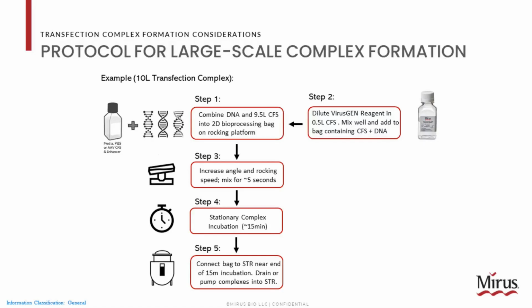So now let's bring it all together and show a real workflow for a VirusGen process at the 100-liter scale. This is from an actual customer process. Here we see that the customer would filter the DNA and complex formation solution into a 2D style mixing bag. This could even be a wave style bioreactor bag. And then they would filter sterilize the VirusGen directly into that mixture. Here, that's just a quick mix, around 5 seconds, not even a specific point. And then a 15-minute incubation before being welded onto a stirred tank reactor and either being gravity drained or pumped into the bioreactor.